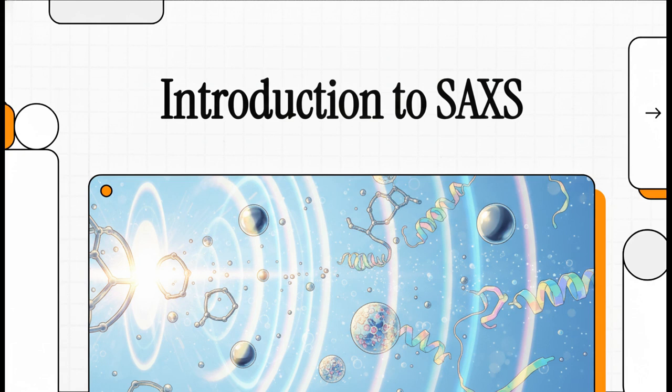Today, we're going to explore one of the absolutely most powerful, non-destructive tools in modern science. I want you to picture this for a second: a cinematic, microscopic visualization of advanced nanomaterials, intricate polymers, and complex biological macromolecules, like proteins, all suspended gracefully in solution. Suddenly, a brilliant, highly focused beam of X-rays illuminates them, scattering light to reveal their hidden internal architectures. That right there is the magic of small-angle X-ray scattering, or SAXS.